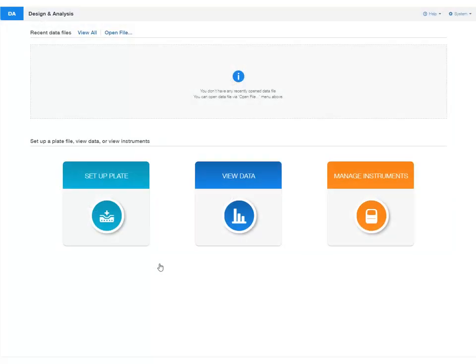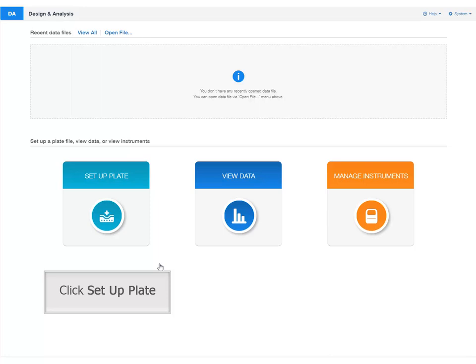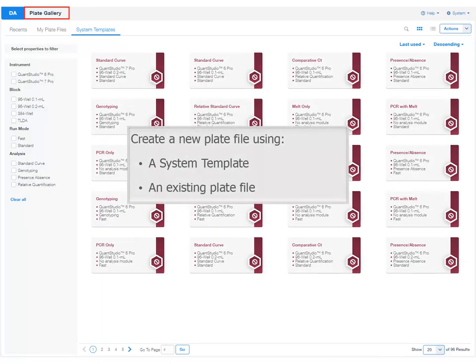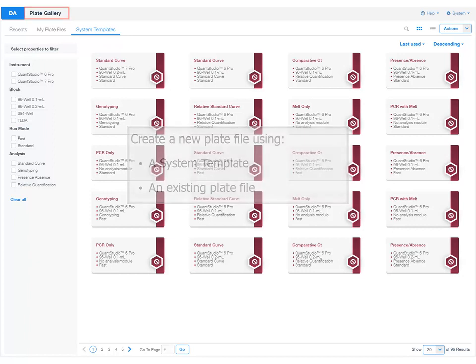In the software home screen, click Setup Plate to open the plate gallery. In the plate gallery, you can create a new plate file using a system template or an existing plate file.